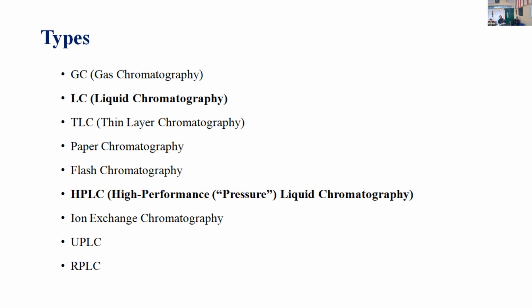The next one is TLC. It is thin layer chromatography. It is a form of liquid chromatography in which a thin layer of stationary phase is coated on a solid support, and once the liquid mobile phase moves through against gravity by the capillary mechanism, it creates the separation of molecules from the mixture.